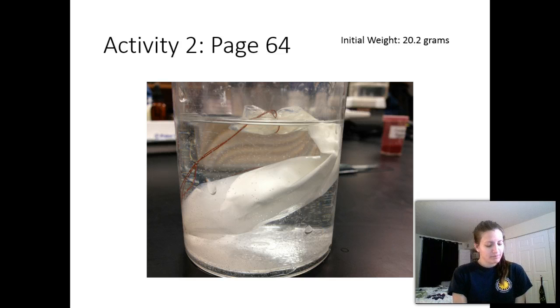And then the final part: if my dialysis tubing gains weight during the experiment, you'll know that water entered the bag. That's the only way it could gain weight. Nothing else could be entering the bag. If my dialysis tubing bag lost weight during the experiment, you know that the water would have left the bag. It has to have left. That's the only way to lose weight in this case.